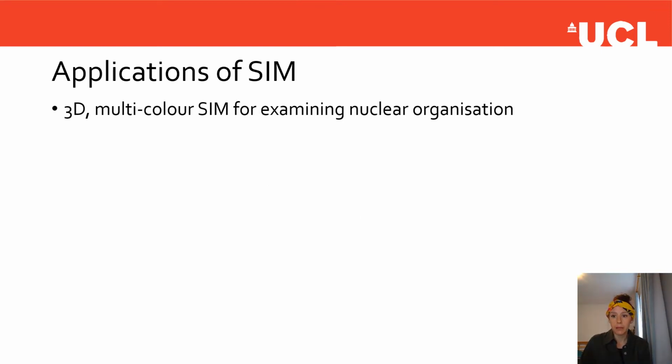Just a quick look at some of the applications of SIM microscopy. There are SIM microscopes available from lots of commercial manufacturers. For example, Zeiss have the Elyra, Nikon have N-SIM, GE/Applied Precision, I think their name is, have the DeltaVision OMX. There's lots of commercial solutions out there for SIM, or you can build your own if you're feeling very bold. But this is just an example of how SIM has been used. So you can extend SIM into 3 dimensions. I'm not going to talk about that now for the sake of time, but it's doable.